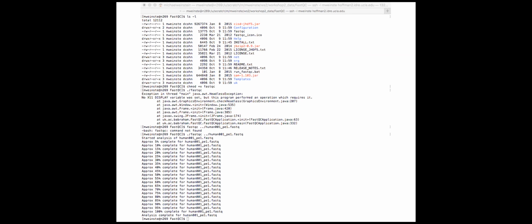If you have a different SCP program, like FileZilla, or there are a couple bajillion of them for Mac, or WinSCP, and you have your own, feel free to use it. I also suspect you might have already configured it to connect to the Hoffman cluster. So everybody's free to use their own. I'm going to show people how to set up a connection. CyberDuck you're going to put on your local computer. CyberDuck is how you move files between your computer and the Hoffman cluster.